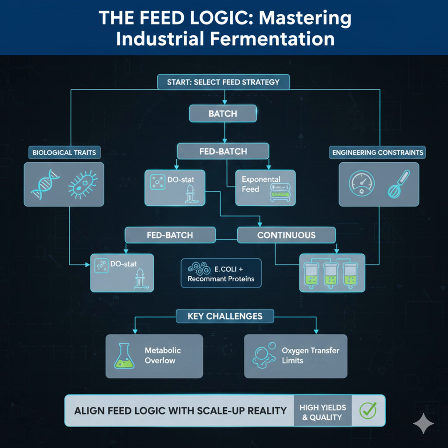But if fed batch is mandatory for maintaining product quality and hitting those high titers, what kind of costs, either capital or operational, are we accepting by making that the mandatory choice? Well, we're accepting complexity, primarily. Fed batch requires continuous sterility management for the feed line. It needs real-time monitoring and a much more complex control system than a simple batch run. So you're trading simplicity for control. You're trading capital expenditure and operational simplicity for metabolic control and, hopefully, increased product quality.